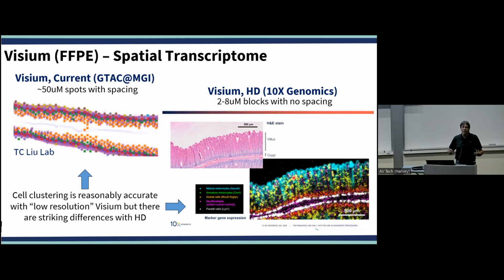I mean, if I can get that resolution with whole transcriptome, well, that's not subcellular. So let's be clear about that. But that's something you're going to have to weigh as well. What will make more sense? And that's honestly where I think, if you're thinking through the experiment, contacting us, we can give you a lot more information that may help you make a decision about what would be a better route to go. Going with a custom panel or a pre-designed panel for Xenium, or going with something like a Visium HD.